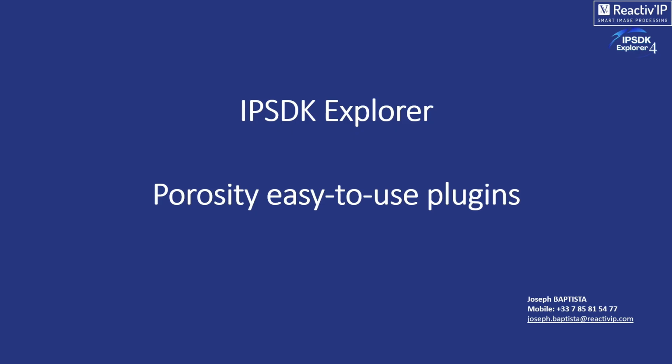We were used to explaining features of IPSDK Explorer, but today we are starting a new format, which is more dedicated to the way of using it and will be focused on our new way of promoting the product using plugins. So I will explain to you what plugins are.